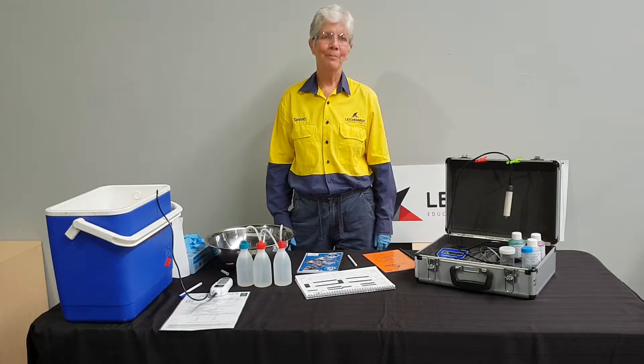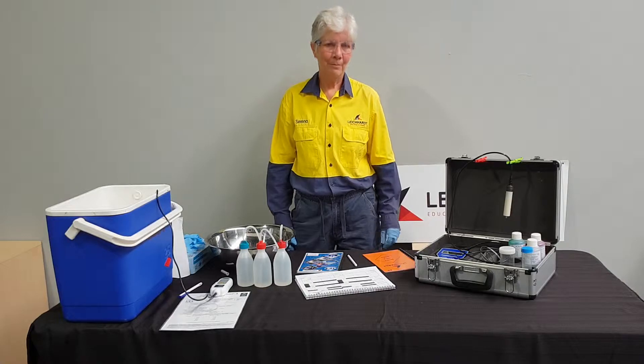In this video we will discuss the importance of the Safety Data Sheets and Serena will demonstrate temperature calibration. Let's start with the Safety Data Sheets.